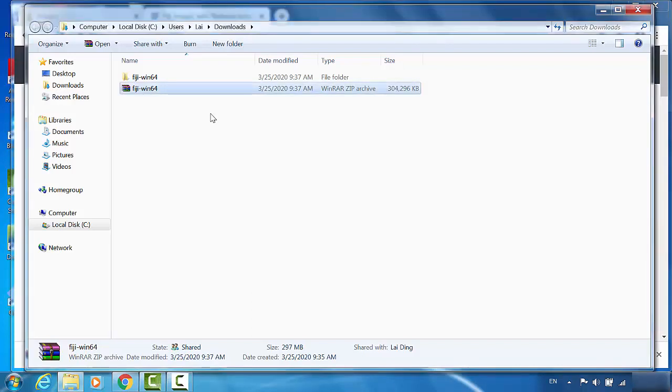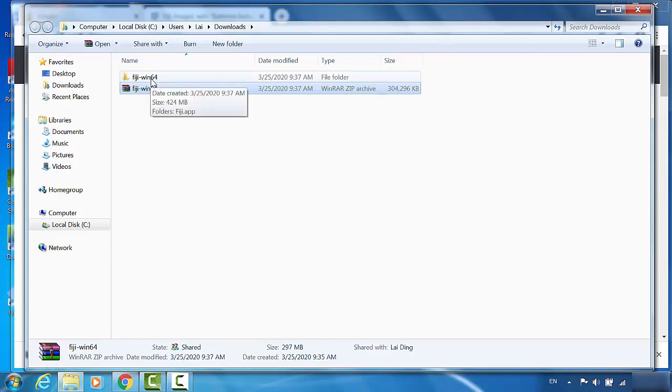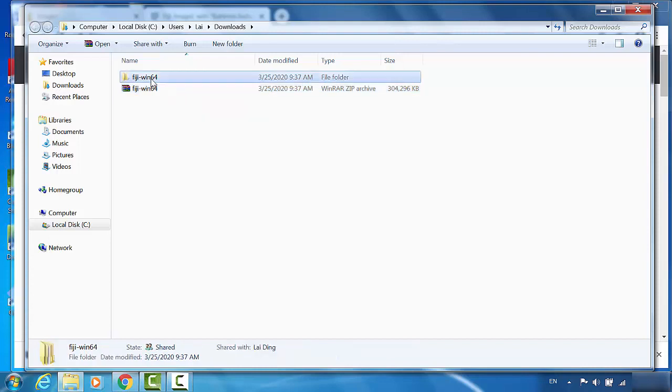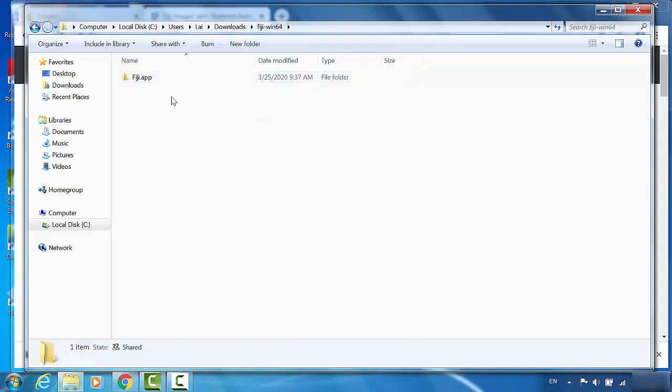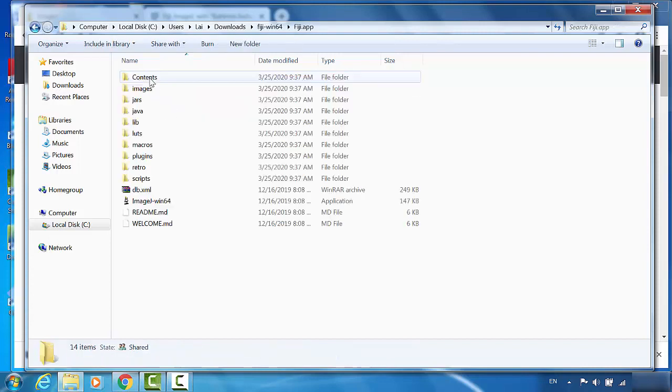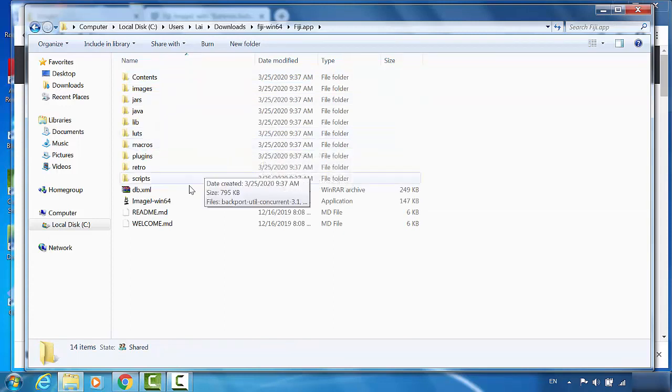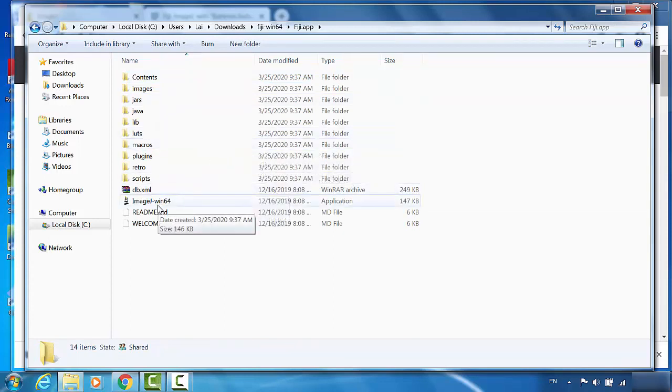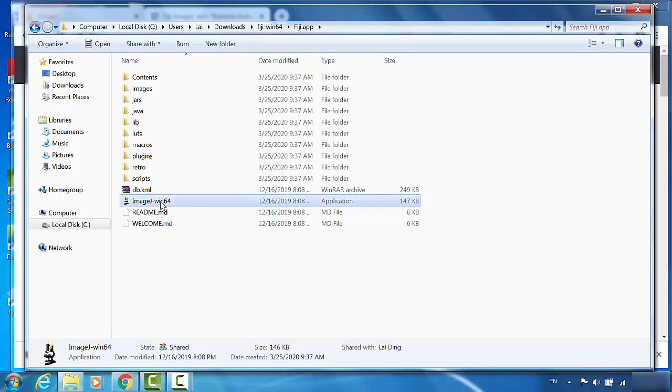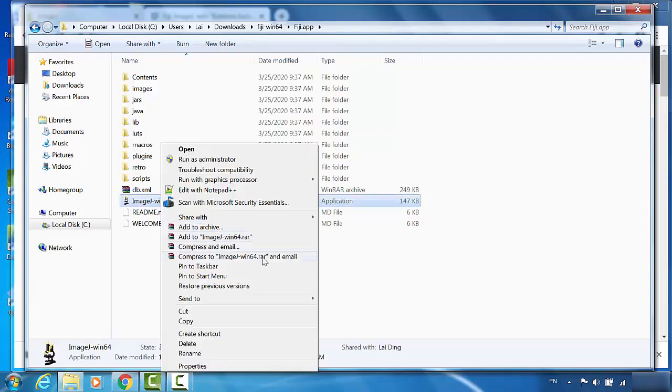After we finish, we'll have a folder named Fiji-Win64. Get into this and Fiji.app. This ImageJ-Win64 will be the program we're going to use. I will send this to the desktop.